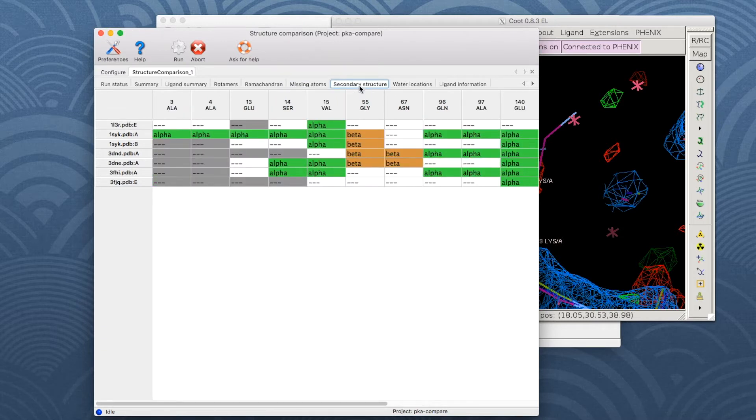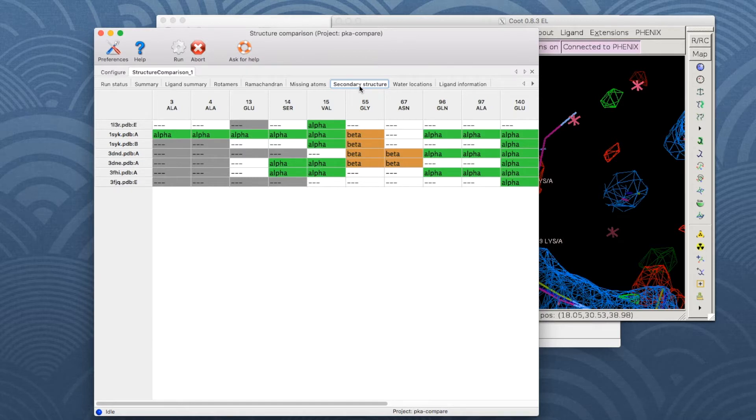The secondary structure table shows any set of matching residues with more than one type of secondary structure assignment, e.g., a residue labeled as a beta sheet in one chain and without assignment in another chain.